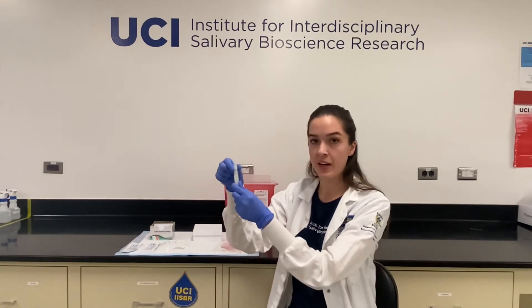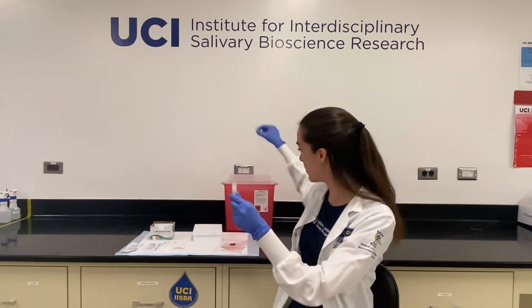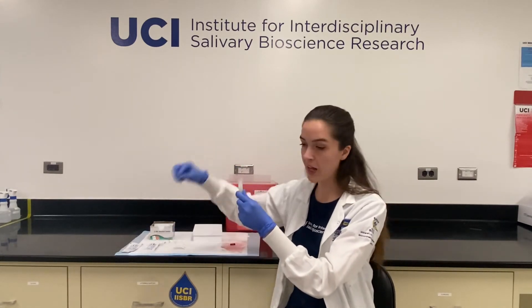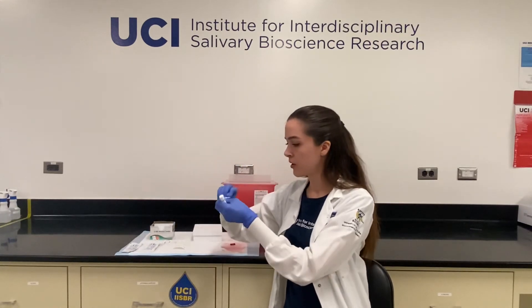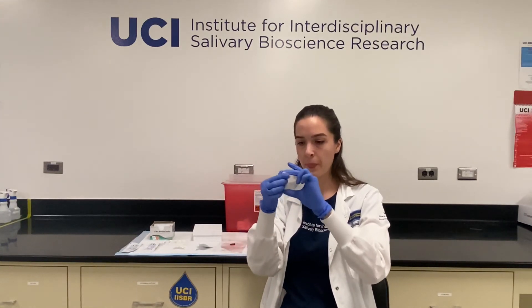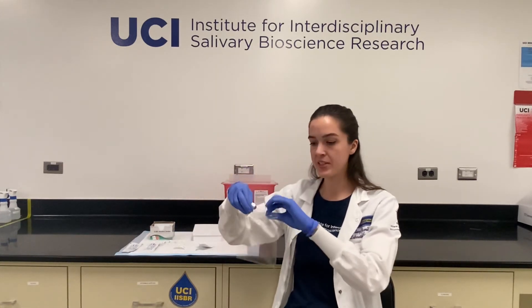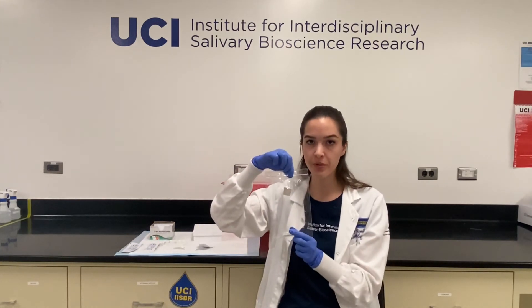Once you've collected the desired amount, remove the straw or saliva collection aid and throw that into the trash. You can then recap your tube, take your alcohol swab, and wipe down the outside of the tube to remove any saliva. You can then place your tube into your plastic bag or box and place this immediately into a freezer. You can then go wash your hands thoroughly.